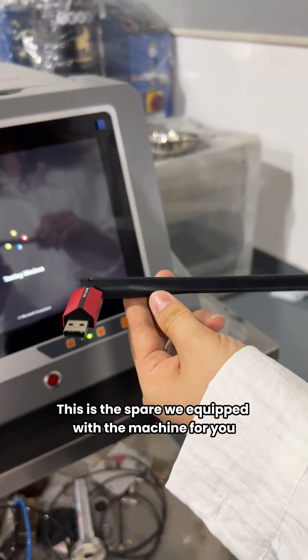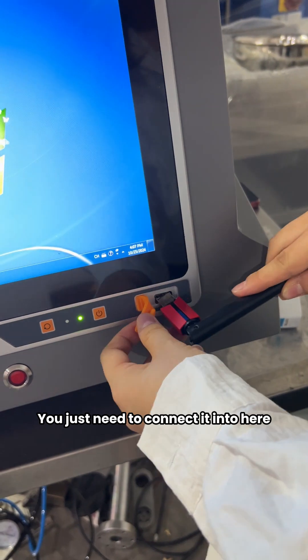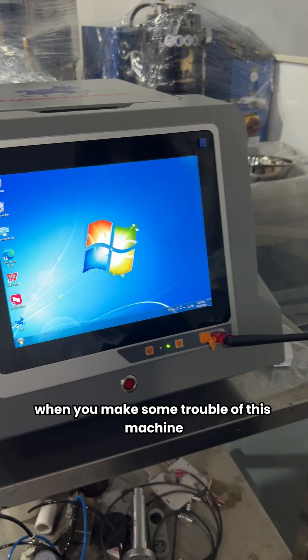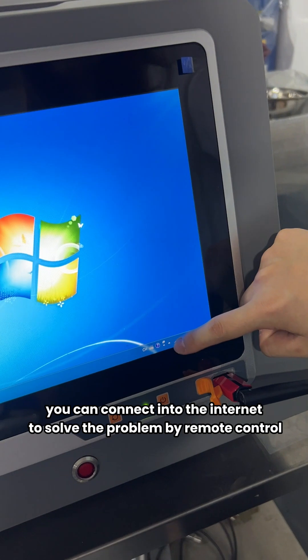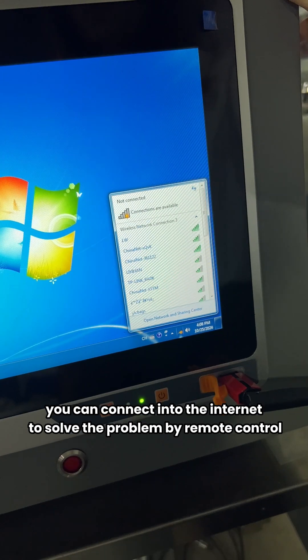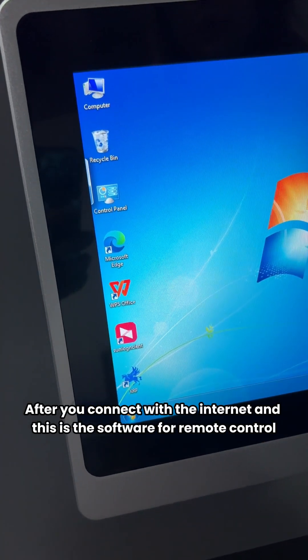This is the space we were equipped with for the machine. This is a wireless internet connection — you just need to connect it in here like that. When you have some trouble with this machine, you can connect to the internet to solve the problem by remote control. This is the Wi-Fi connection of this machine.